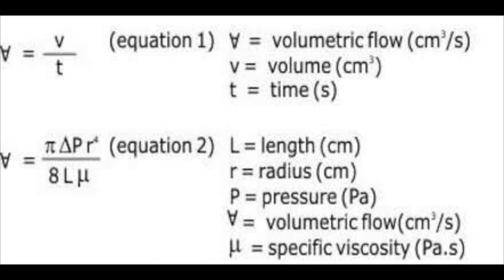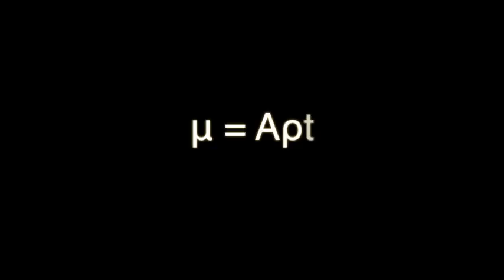Further rearranging the equation and treating some values as one constant with simplifying conventions, the result would then be: this is the equation that we will be working with, where ρ denotes the density of the liquid sample and T denotes the average flow time per liquid sample.